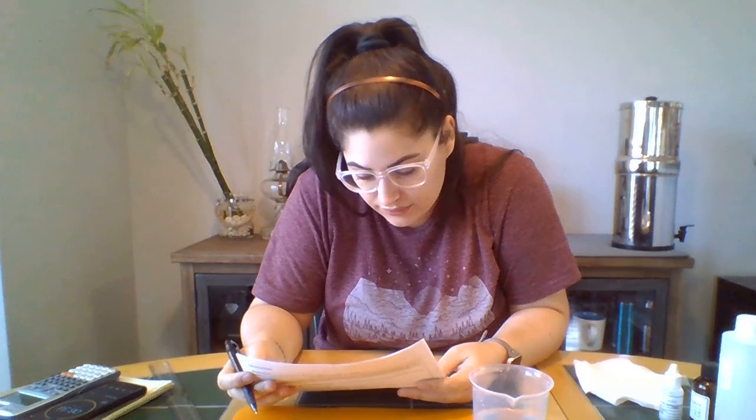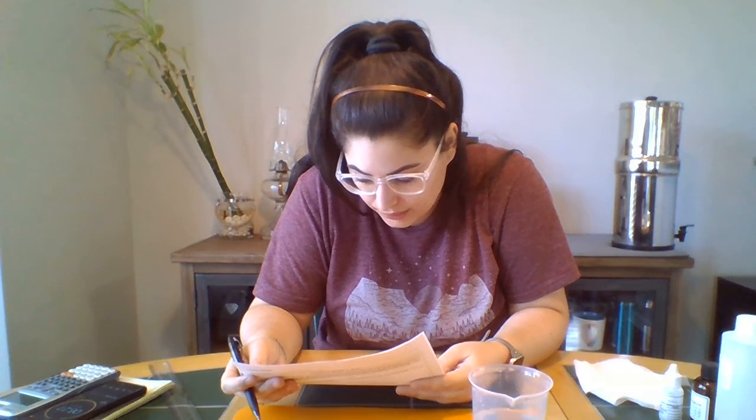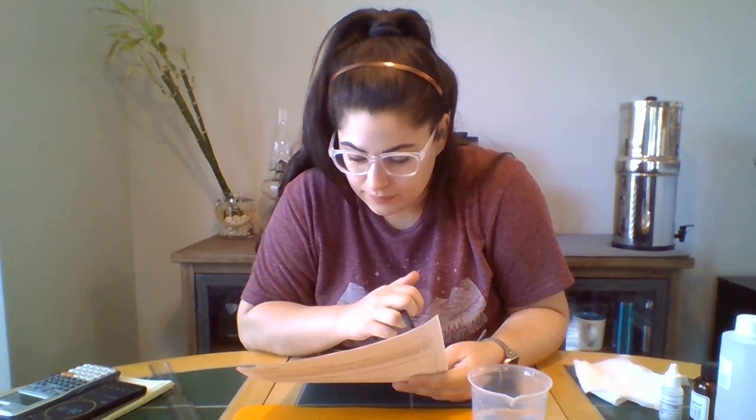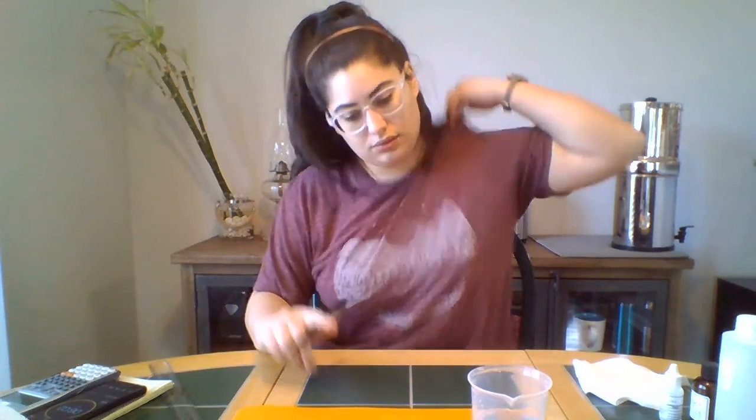Okay. Let the blocks rest in the vinegar for 7 minutes. Observe as the blocks begin to change color from blue to clear. If any of the blocks completely change color, record how long it takes for complete color change to take place. After 7 minutes, remove the blocks from the vinegar solution. Pour the remaining vinegar down the drain. So that's the only thing we really have to record. We just kind of have to watch it.